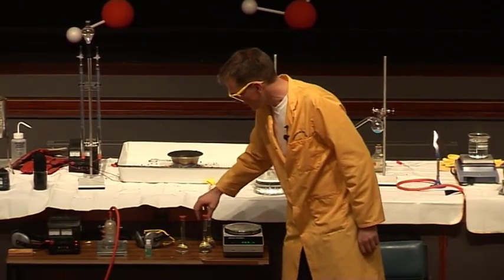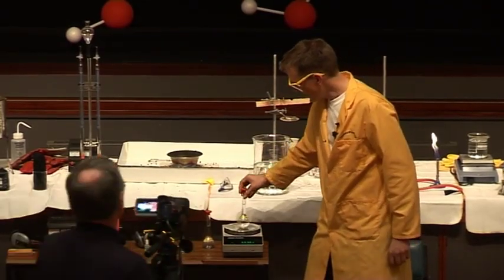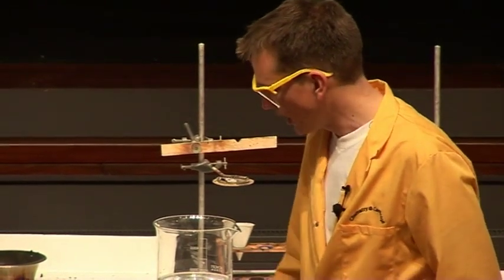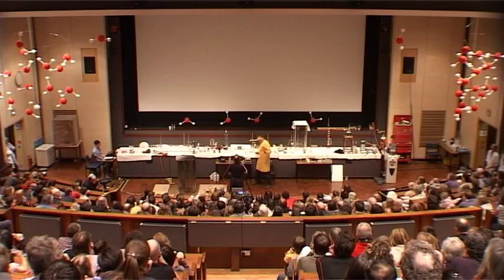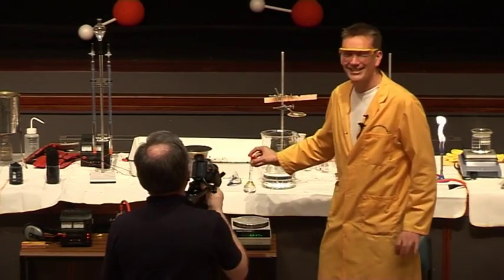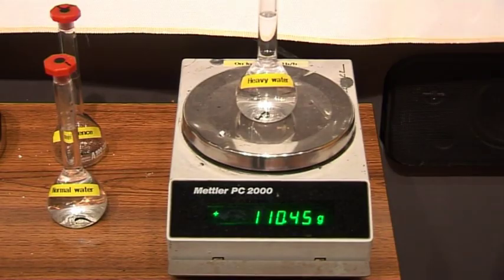And in this identical flask with 100 milliliters of water, we've taken into account the weight of the flask, but we see that 100 milliliters of water weighs just about 100 grams. That's the density of water, 1 gram per centimeter cubed or per milliliter. Now here I have some heavy water, and it's exactly the same amount, 100 milliliters, and this weighs 110 grams. Okay, so this is heavy water.